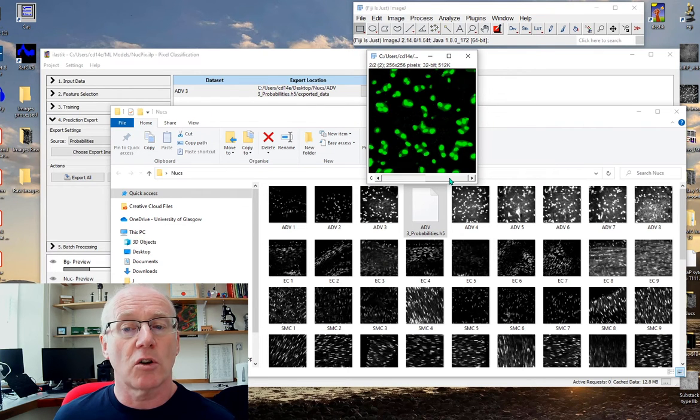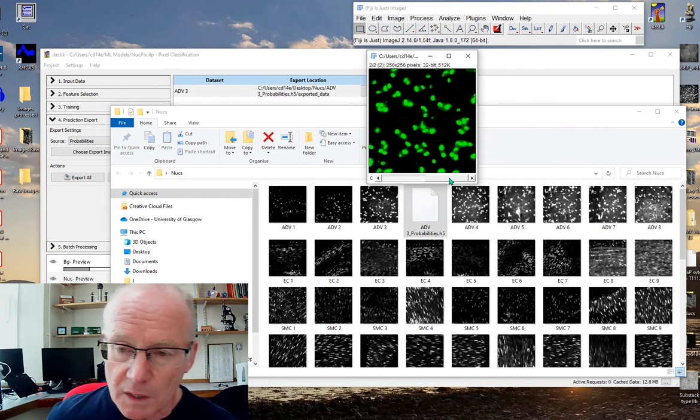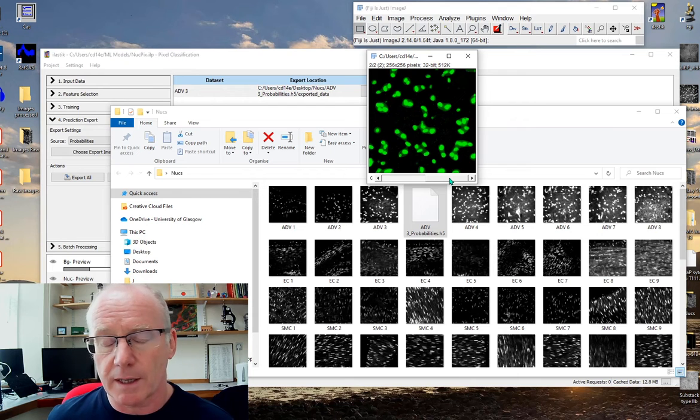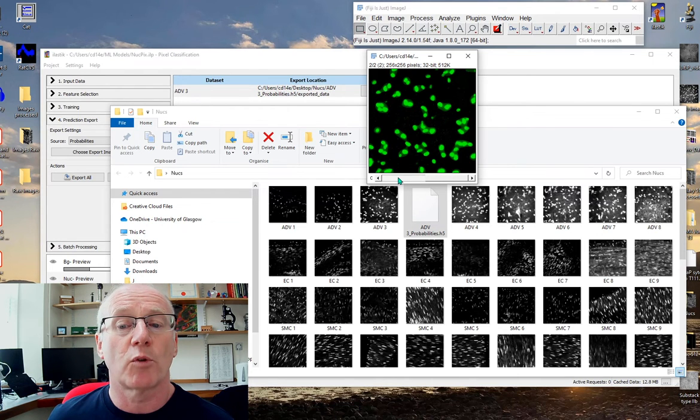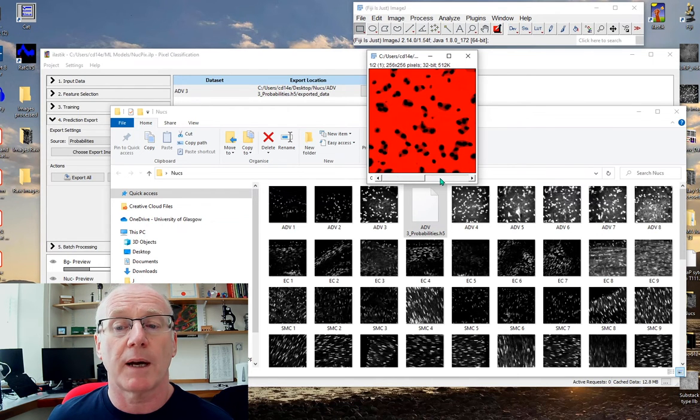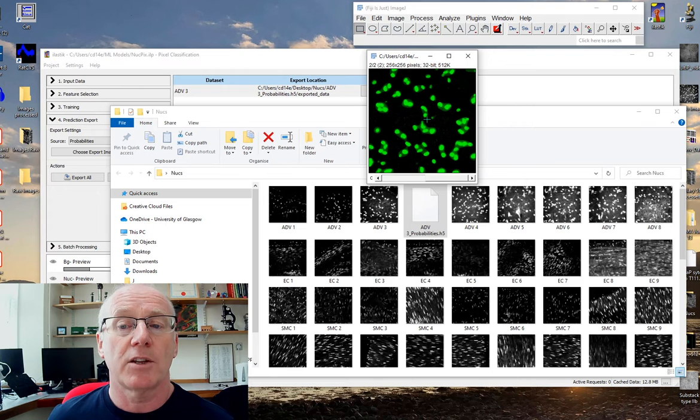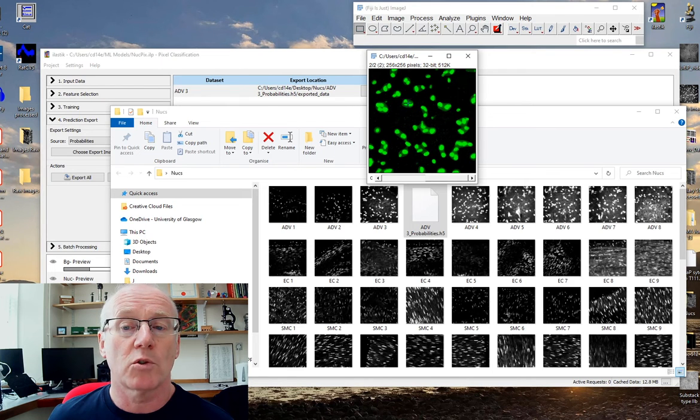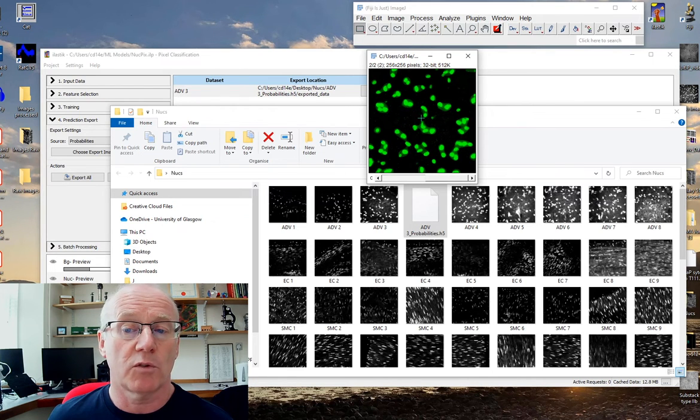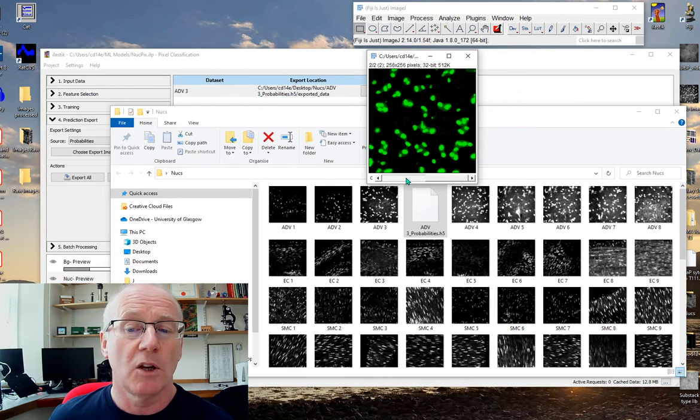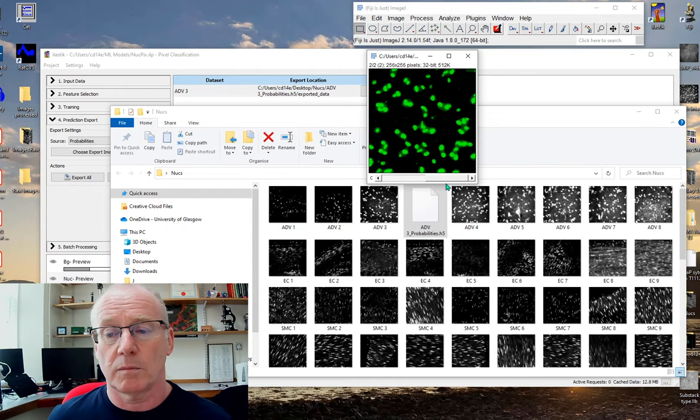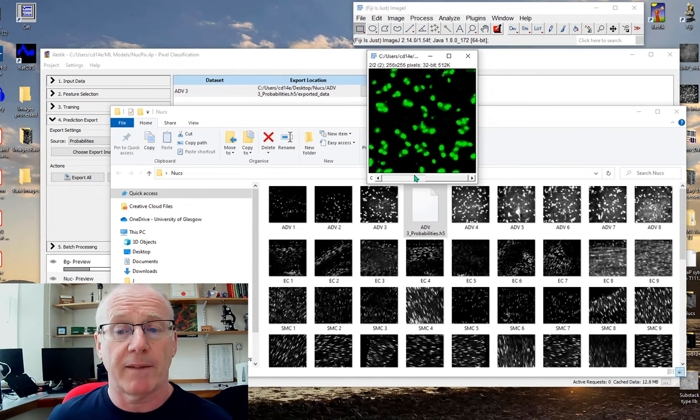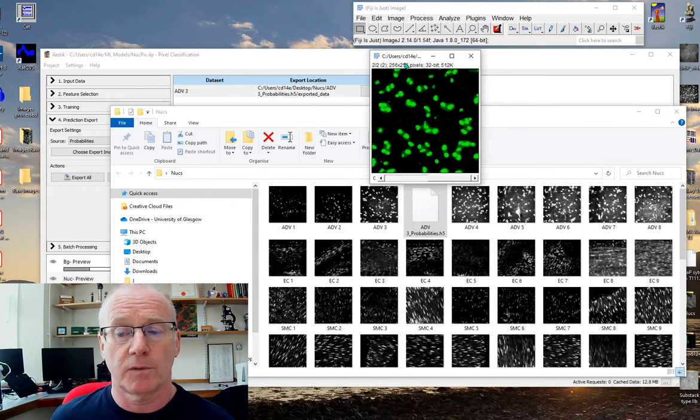Now this is not a segmentation, this is a probability map. As you run the mouse over the image it gives you some values for probability. You would have to segment that image yourself.